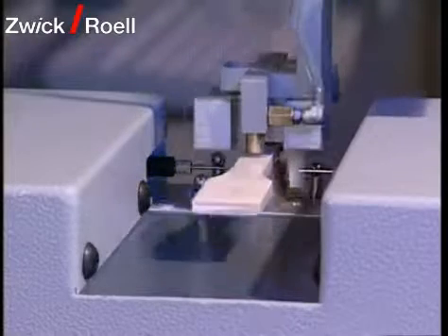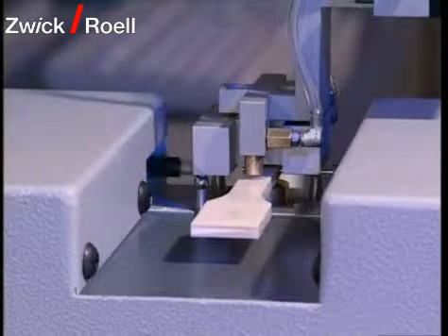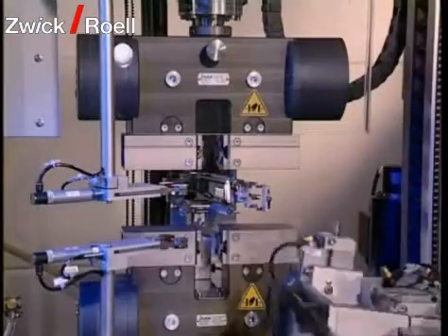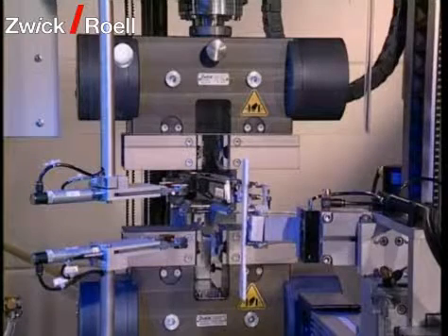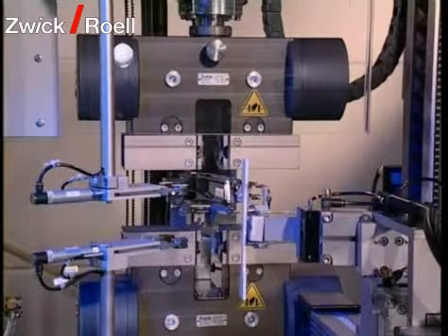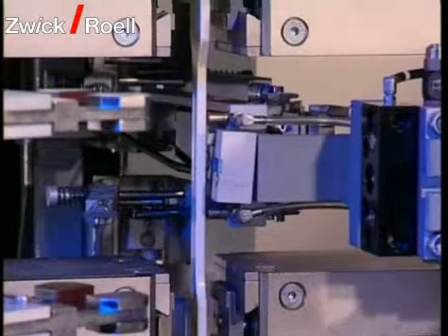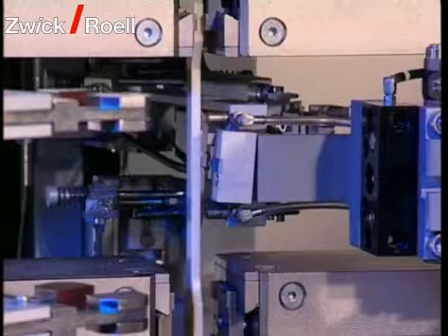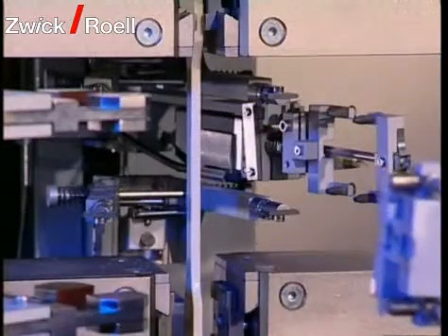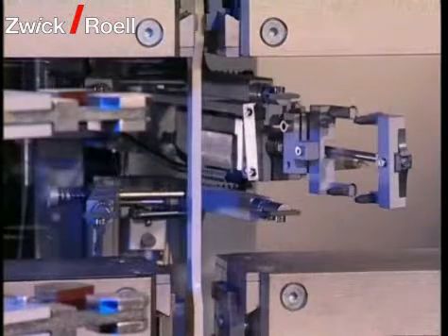The cross-section is calculated by measurement of the width and thickness. The specimen feeding system can be combined with all testing machines up to 250 kilonewtons. After the correct gripping length has been set, the specimen is placed in the grips by the handling system and the test is started.